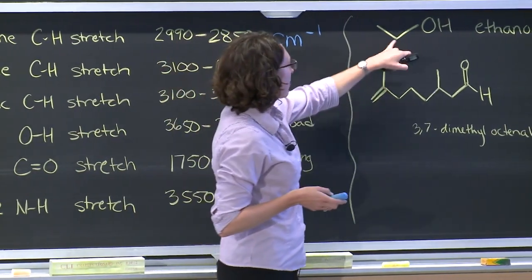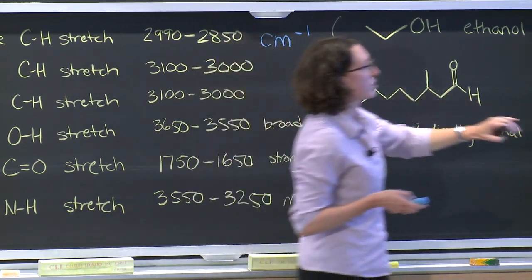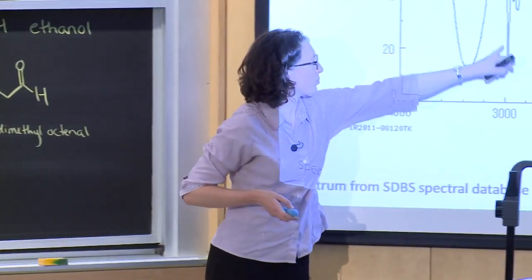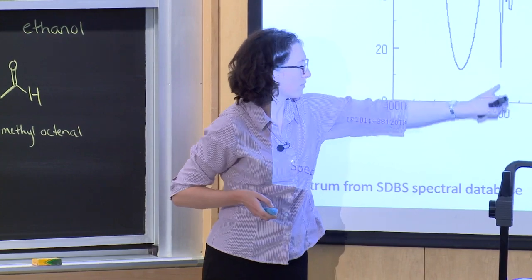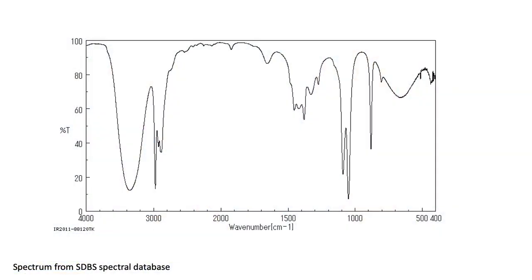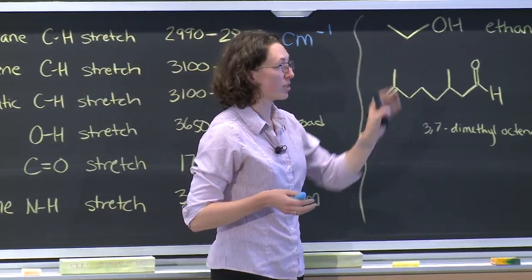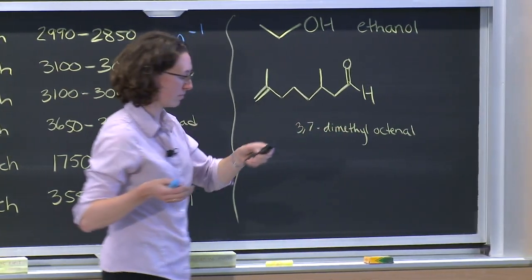And then we have some methyl CHs and ethyl CHs here. So you have alkane CHs, and those show up a little bit below 3,000 wave numbers. Great. And then you may be able to find the CO bond that typically shows up around 1,000, give or take. So maybe one of those peaks is your CO stretch as well. Sometimes you can go into that fingerprint region if you know that there is something there that you are looking for. The CO stretch is one that you typically can see, and it's typically pretty strong. So in this case, it is there. But yeah.